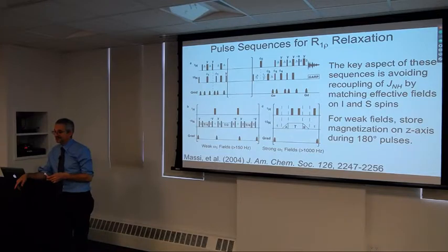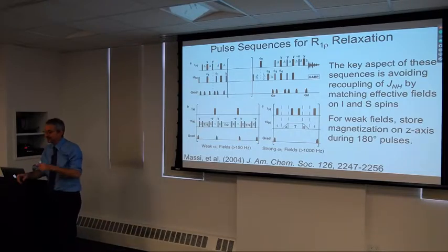In addition, B1 inhomogeneity means that omega e isn't a fixed number. It varies due to the B1 inhomogeneity, so there's additional dephasing. So usually that orthogonal component decays away very fast, and it's just signal lost to us. That makes the experiment inefficient. So usually we want to get as much of the magnetization as possible aligned along the effective field.